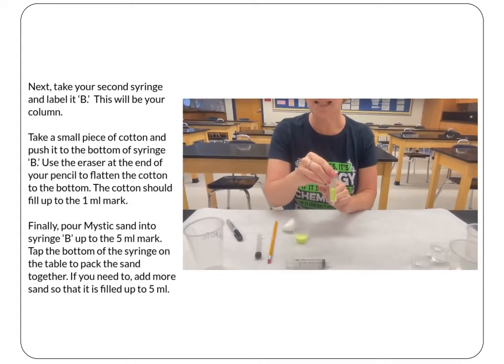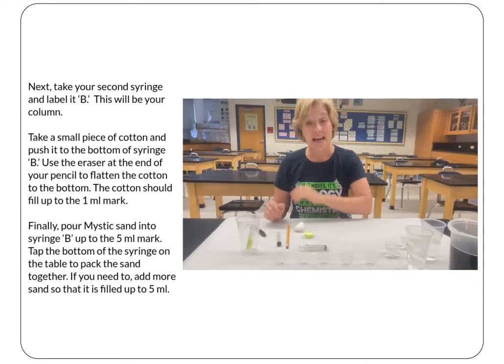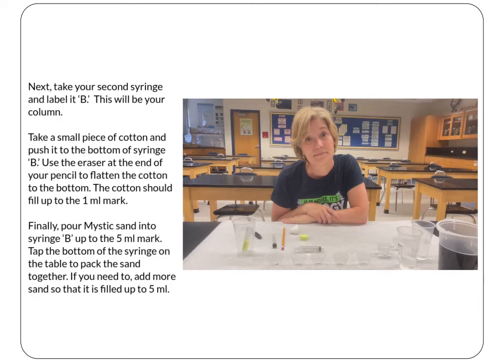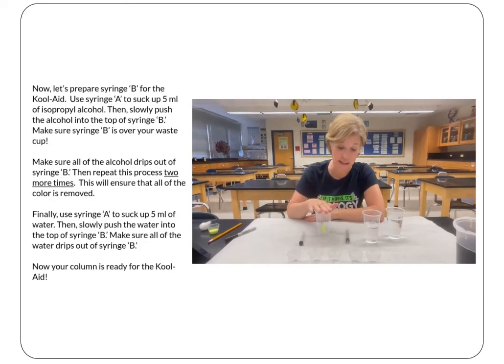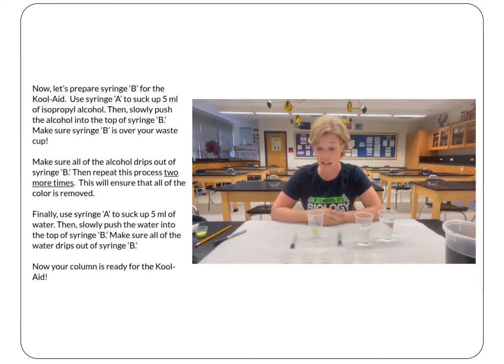Okay, so I'm now going to take this and put it in the waste cup so that it stays upright, and I'm going to get the next part of this completed. So we have our column set up and it's sitting in our waste cup. We are going to need to prepare it for the Kool-Aid, and to do that we'll need a few things.